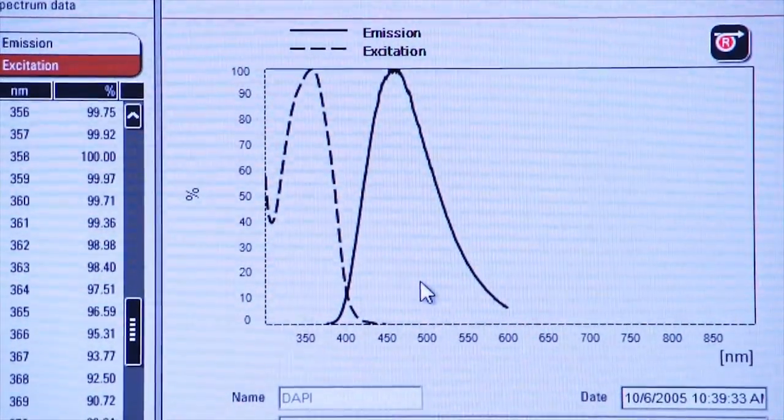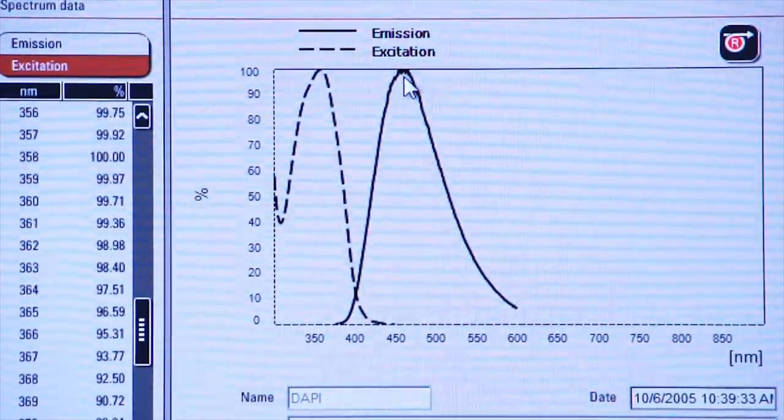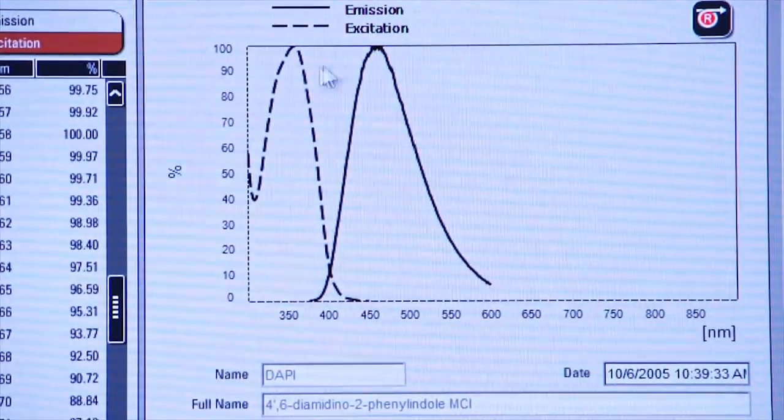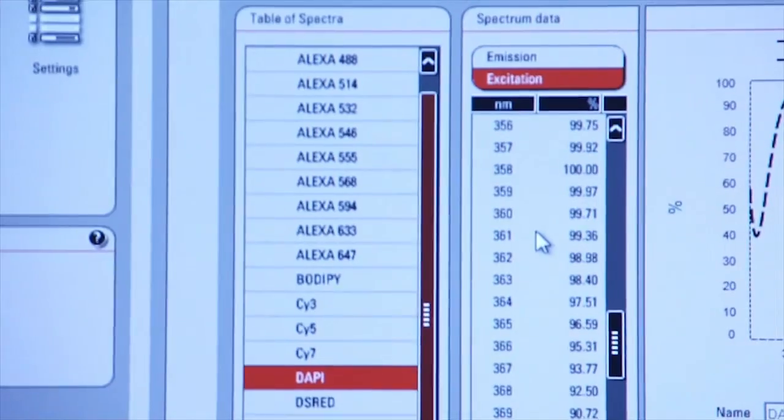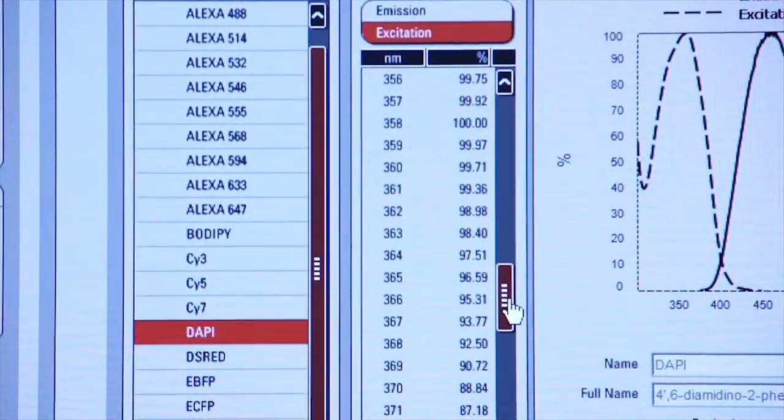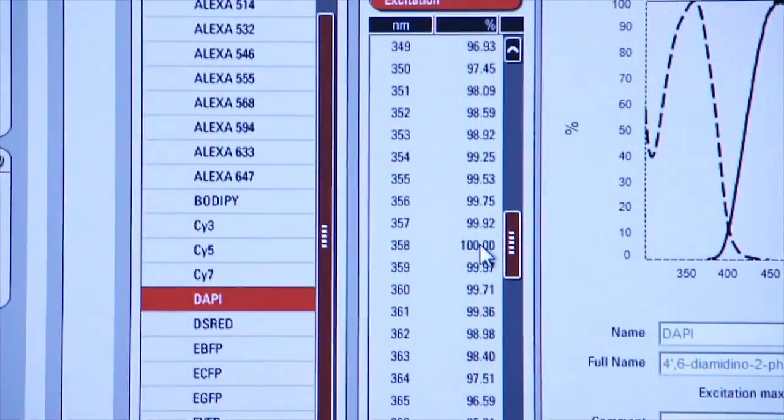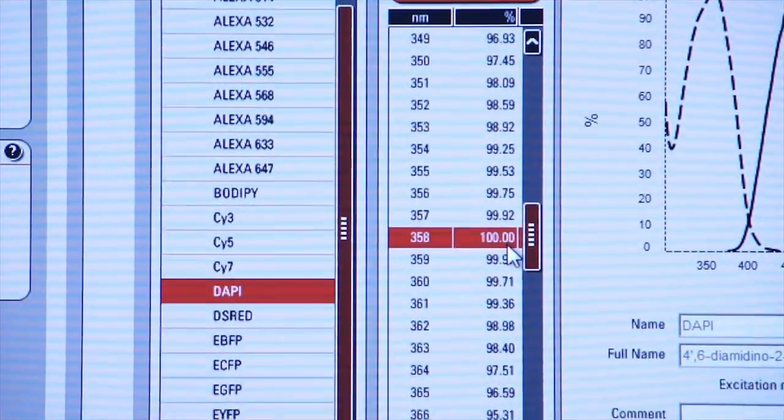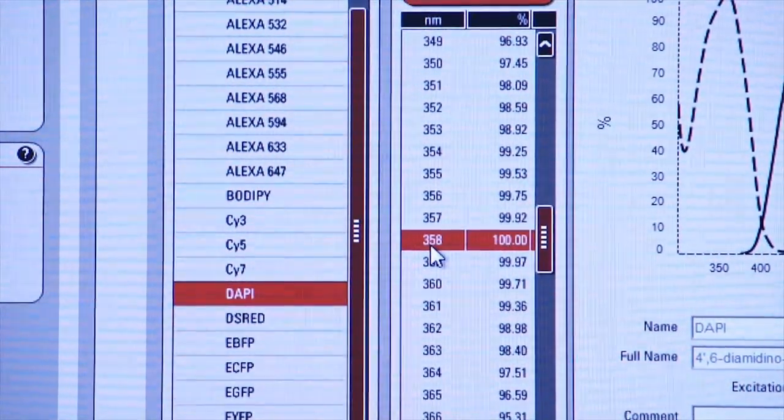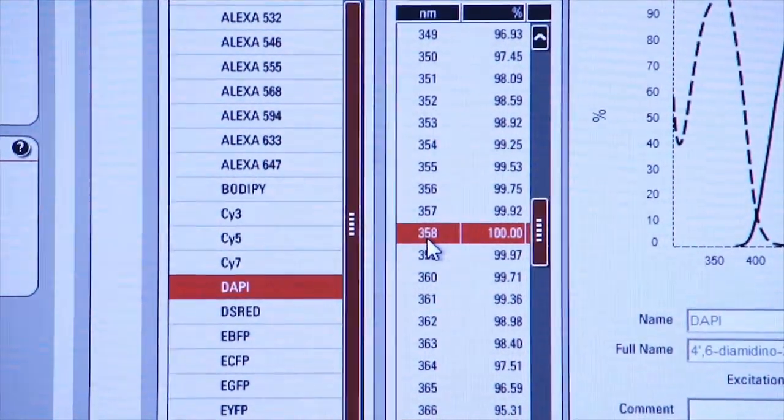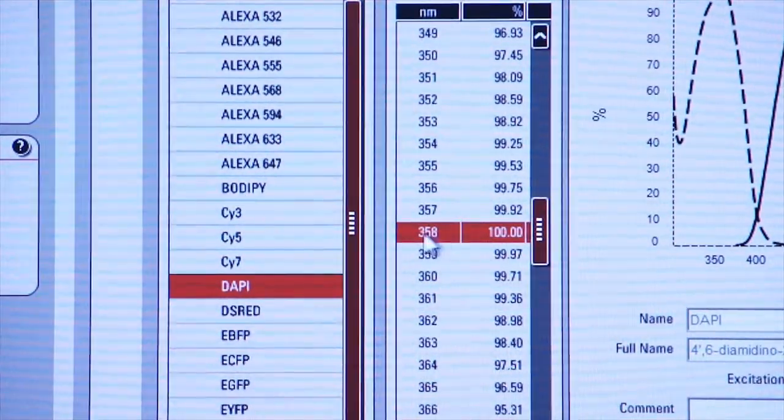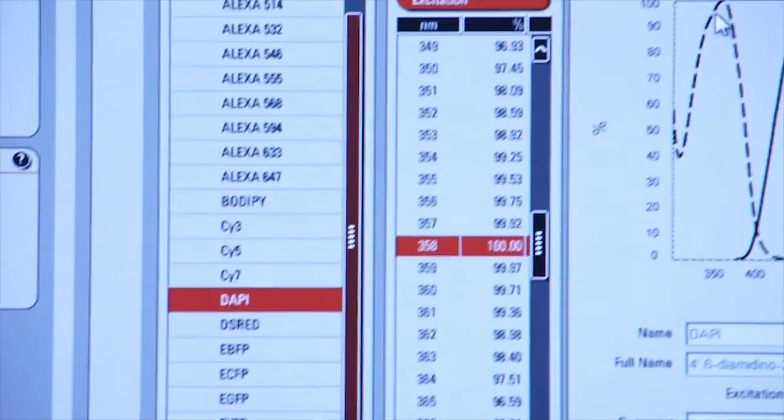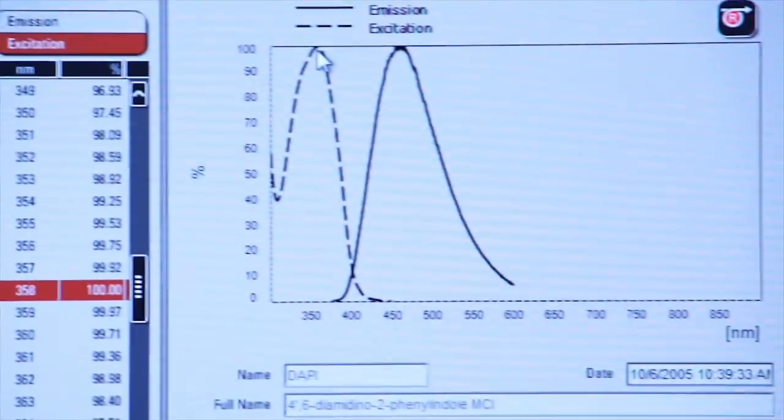Again, it has a peak. We can find that exact peak on this listing of numbers. If we scroll up and down here, you'll see 100% excitation takes place at a wavelength of 358. So that is the peak excitation wavelength that we want to use to excite DAPI.